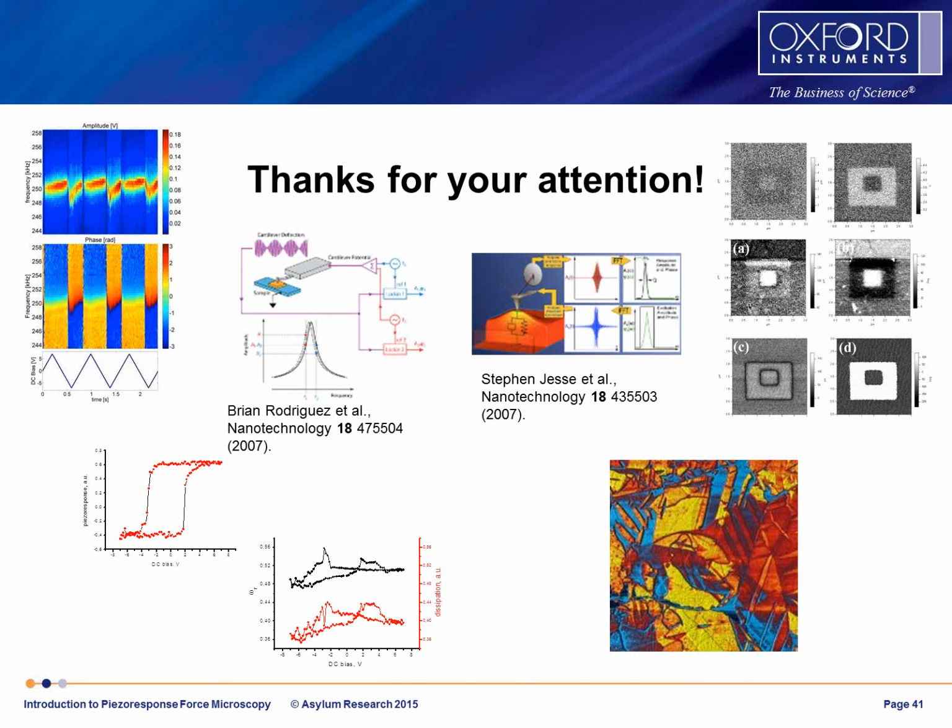Then we start to deal with the environmental, acoustic, and electromagnetic noises, most notably the 60 Hertz cycle, which appears due to the crosstalk between the electric power sources and microscope electronics. This one is very easy to identify simply based on the periodic waves in the image. So how to separate and identify them? In some cases it helps to record the signal at each pixel as a function of time and try multivariate statistical methods that can separate noise components. But I'm afraid there is no universal answer.